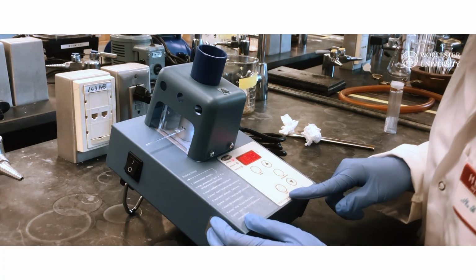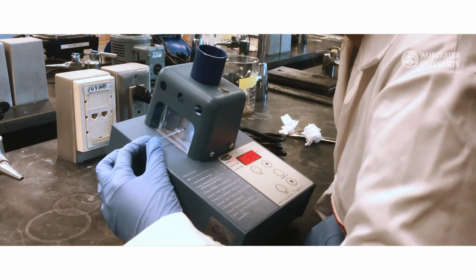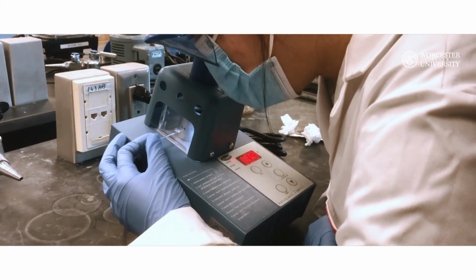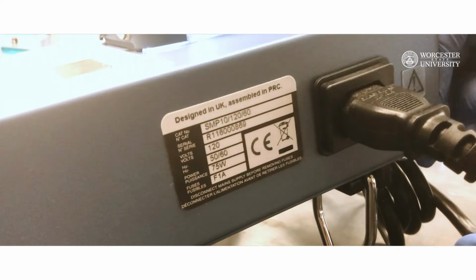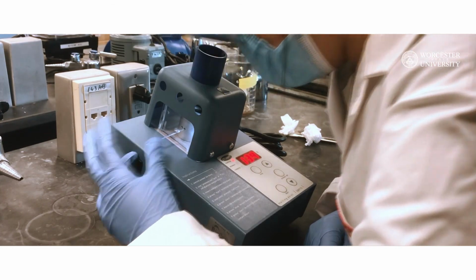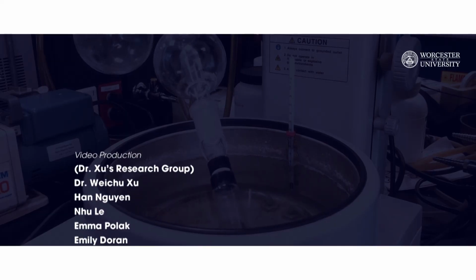Here, when the apparatus reaches the plateau, we press the start button so the apparatus can begin heating up slowly until we obtain an accurate reading of the melting point range. As the final step, we report the melting point range with the manufacturer and the model number of the instrument we used. You can even repeat the process to make sure that the melting point range you obtain is accurate and reproducible. And that is how you determine the melting point range of a compound.